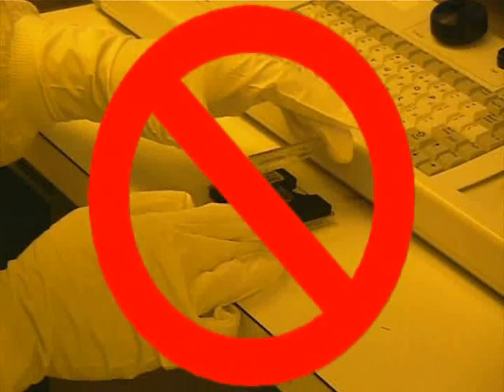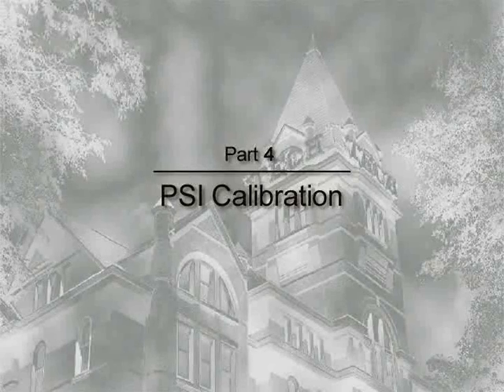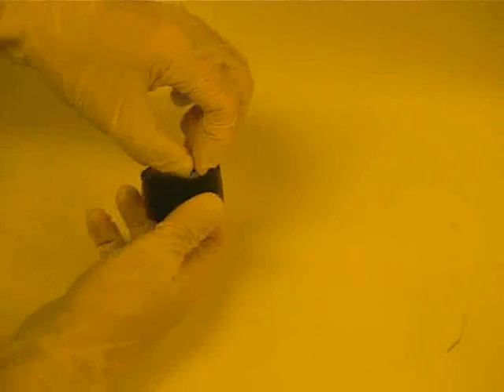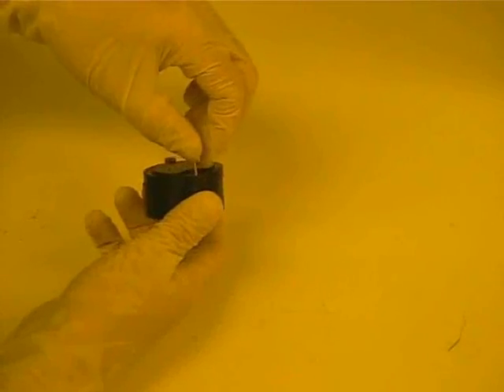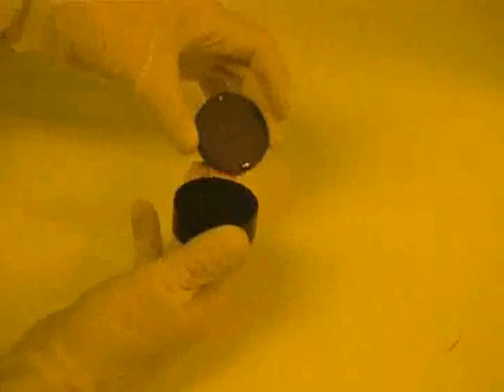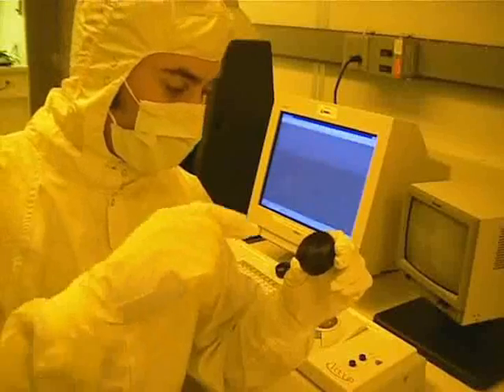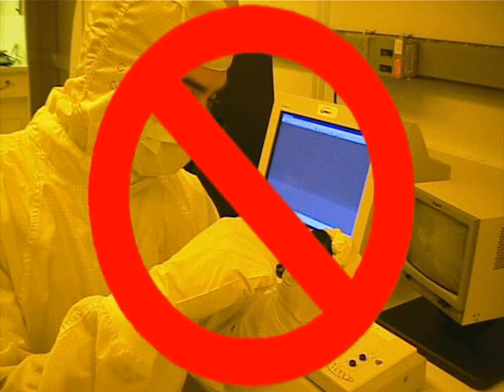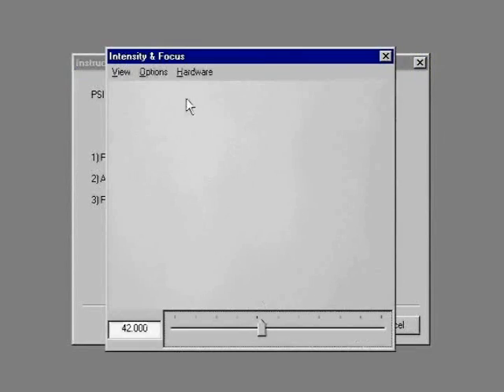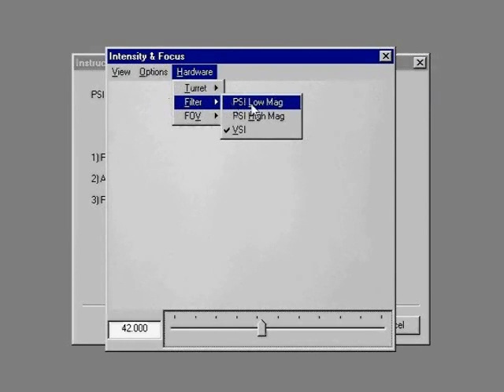Be sure to place the sample face down on the buttons. This is a PSI calibration sample. We keep the sample covered to prevent damage. To remove the cover, twist the screws. A point will come when the screw will lift up — the lid will capture it. This prevents the screws from being lost. Be sure to place the lid face up. This will prevent any contamination from coming in contact with the lid. The PSI calibration sample is an optical flat. It is extremely important to be careful with the flat and prevent the sample from getting scratched. We return to the intensity window. Go to the hardware window. Choose filter. We must select PSI low mag.